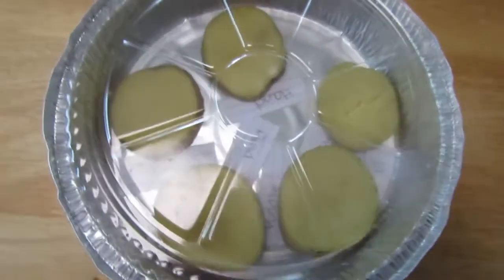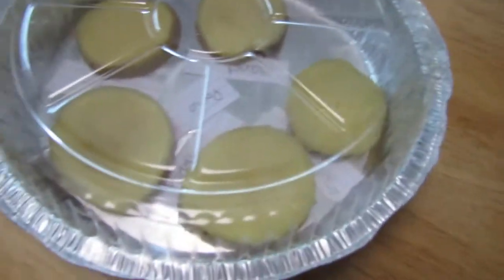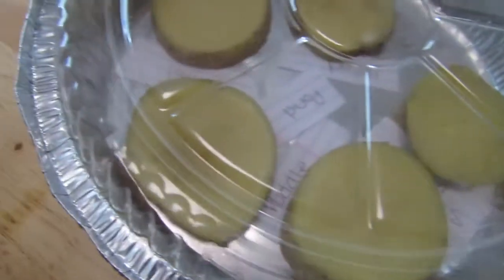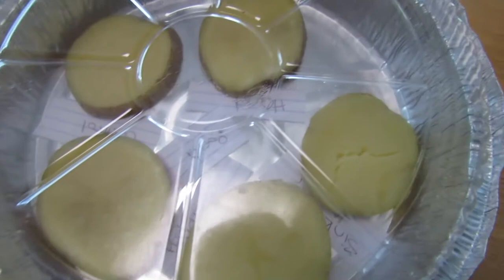Day two. Looks like we don't have anything growing yet. That doesn't surprise me because we're incubating it at room temperature, so the growth is probably going to be a little bit slower. But I did this last night, so we'll see what happens tomorrow.